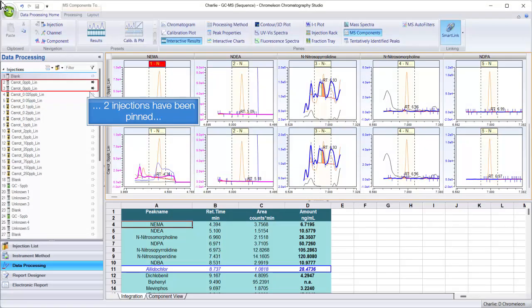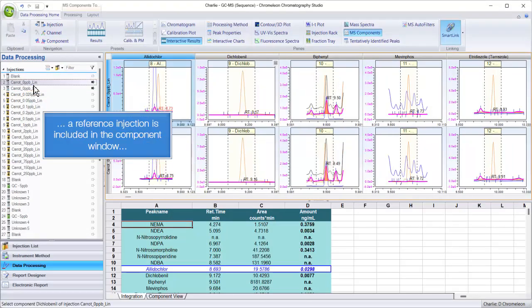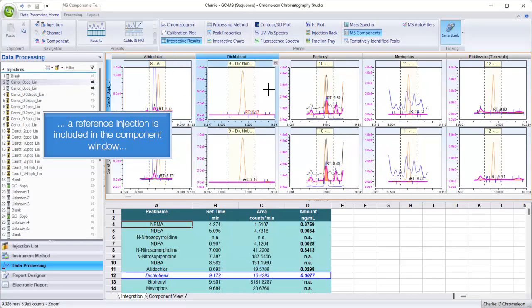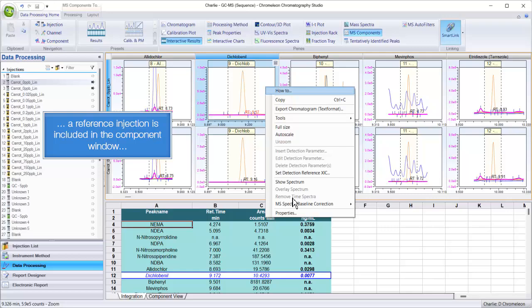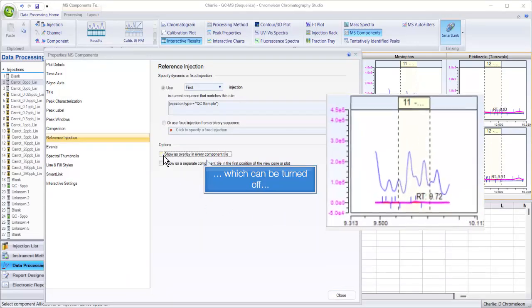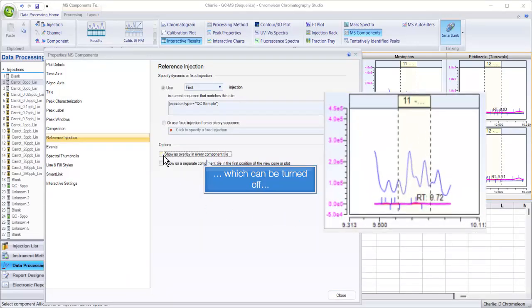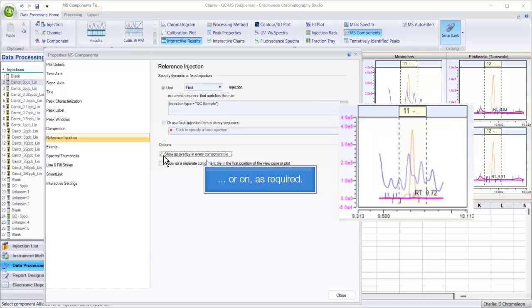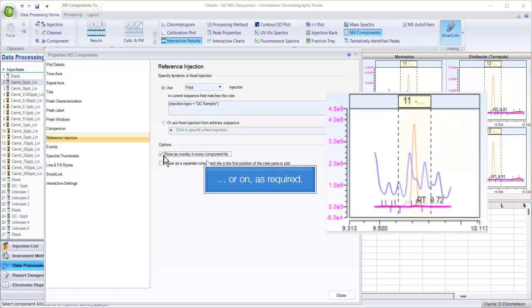Two injections have been pinned. A reference injection is included in the component window, which can be turned off or on as required.